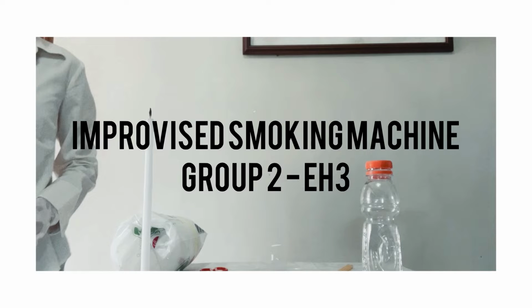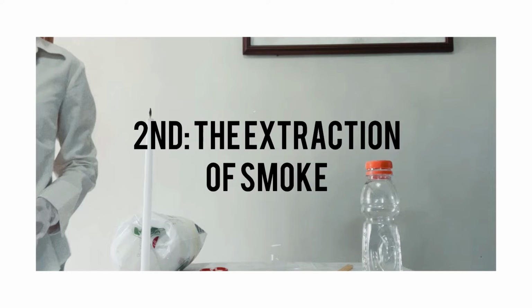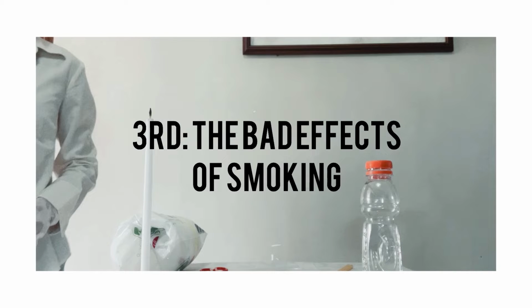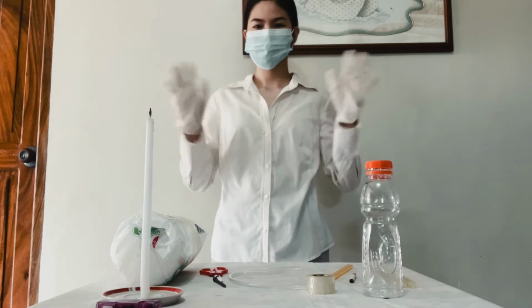We will present an improvised smoking machine made from accessible materials at home. The video will be divided into 3 parts. First is the process of making the machine, second is the extraction of smoke, and third, the bad effects of smoking. Let's get started. So how to make an improvised smoking machine?